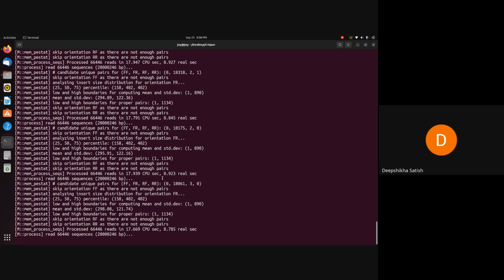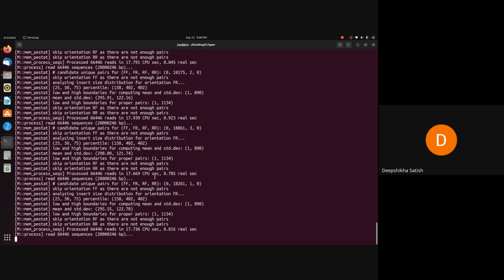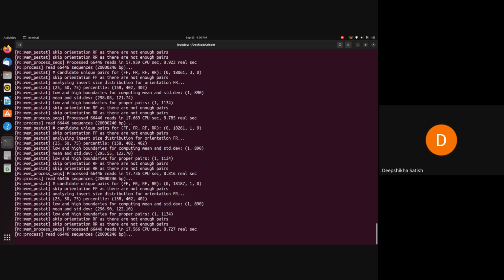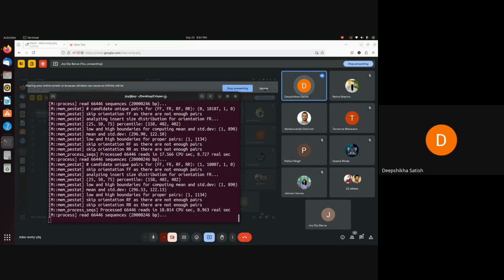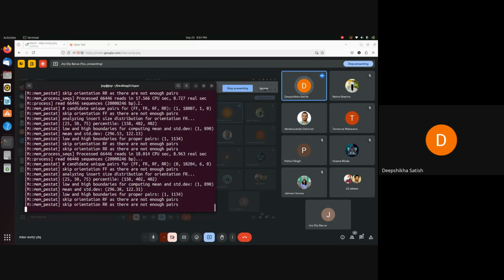So I think it is processing now. Yes, ma'am. Maybe it is having an error. It will stop up to this point. But I think your trimming is having some issue, sir. So just solve the trimming problem properly. Okay, ma'am. For now you can just go with this and proceed further, because this is just for demo. But after everything is done, just check the trimming once.